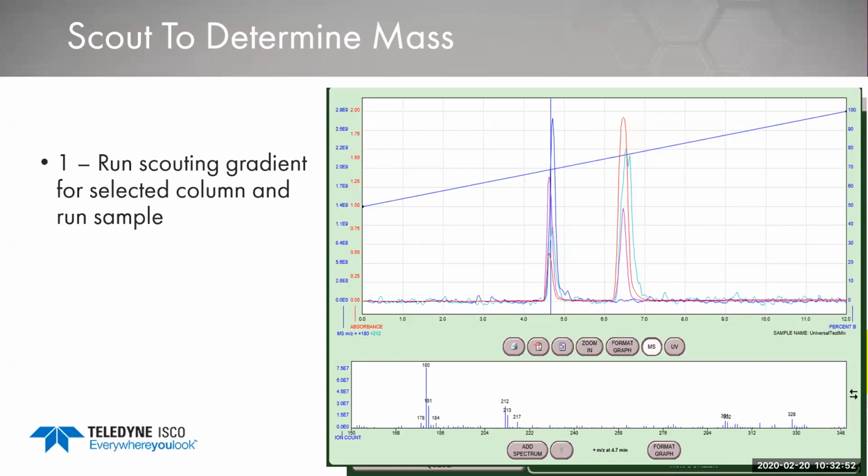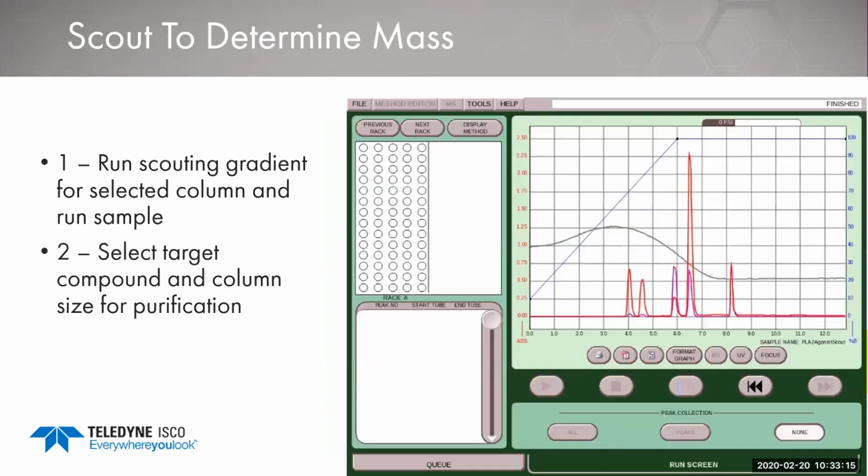Many different reasons. Usually, the ones that I have seen, it's because over a period of time, someone hasn't actually tuned for a very, very long time. So the mass alignment has drifted so far that we can't actually push it into the box. So we're basically trying to put a square peg into a round hole because we were too far from the window that we have set.